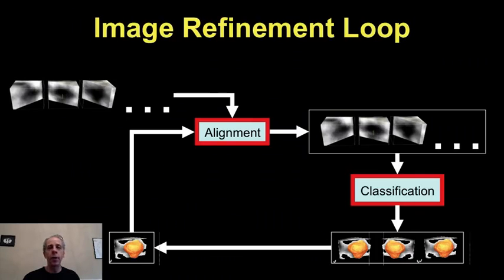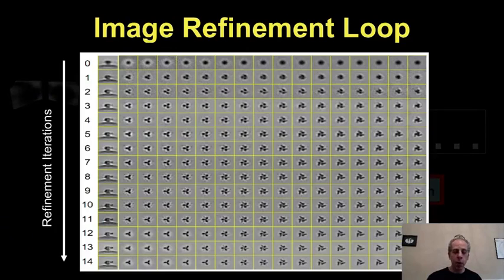This is what you see. This is your raw data. You put the virus, you did the cryotomography, you basically put all the tilts together. This is what you see, and you say, oh boy, what am I going to do with that? But you remember that you just developed an algorithm that is working for other things. So you plug your algorithm into that. You find the envelopes, you do the alignment, classification, alignment, classification, and then you start seeing progress.